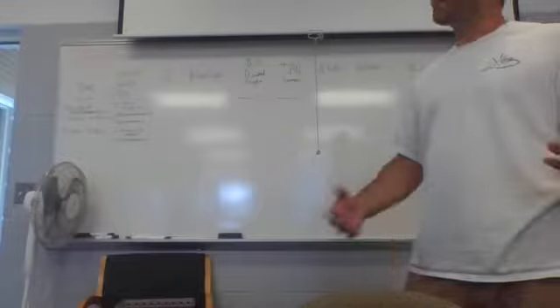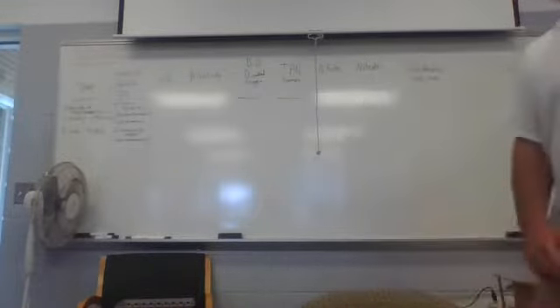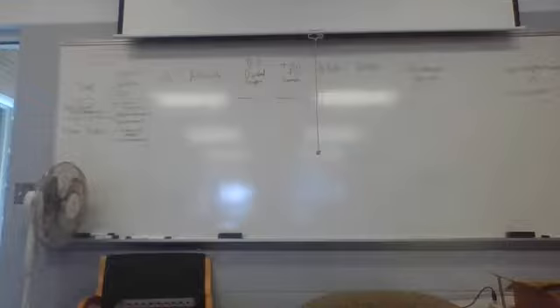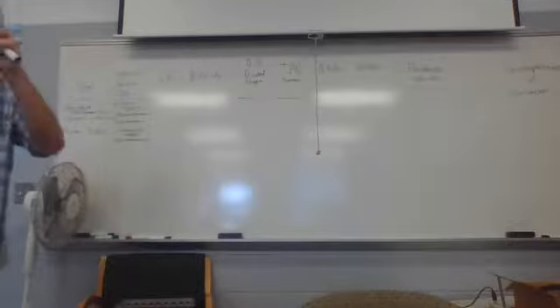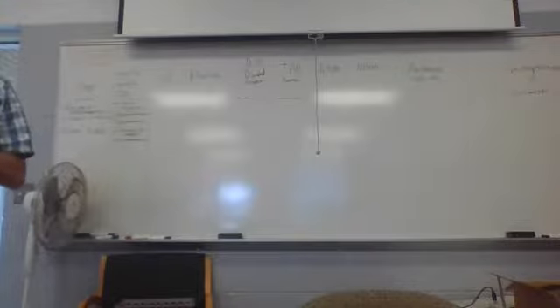Do you want me to come up with off the top of my head what the difference is? Well, no. I'm not sure I can do that. The way I explain it for a colorimeter is basically, maybe you've all done a chemical test, even if it's just your very first test on your tank. You add some reagents and you mix it up and you wait and you look and you're comparing it to a chart, and sometimes you think, I'm not sure if I'm colorblind or if I can't match it to one on there. It's hard to read the colors, and we all see colors a little bit differently.